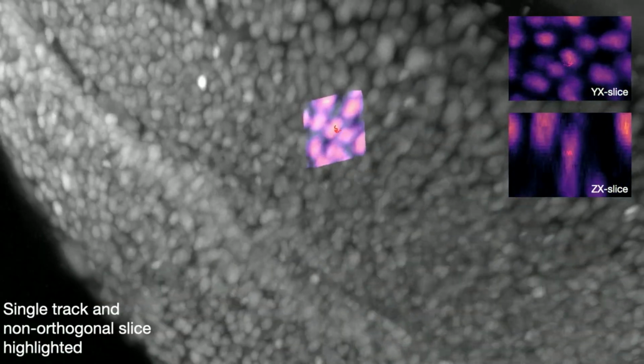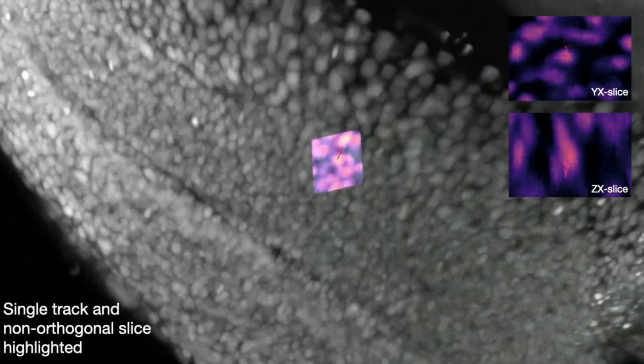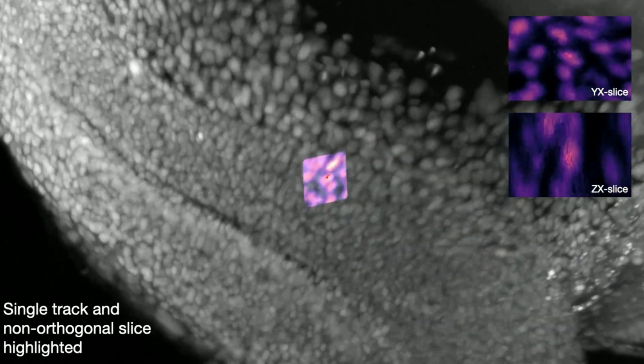And with this tool, we can now track all these cells in our developing zebrafish embryo. So here you see a part of the embryo, and we zoom in on a single cell, and the red line is the trajectory of that single cell. We can do that for a single cell, but ULTRAC does it at the same time for all cells in the zebrafish embryo. So what you see come up here, all these colored trajectories, are the paths of every cell in this embryo.